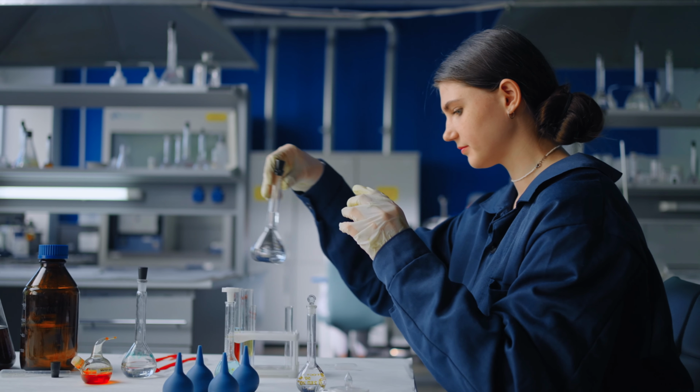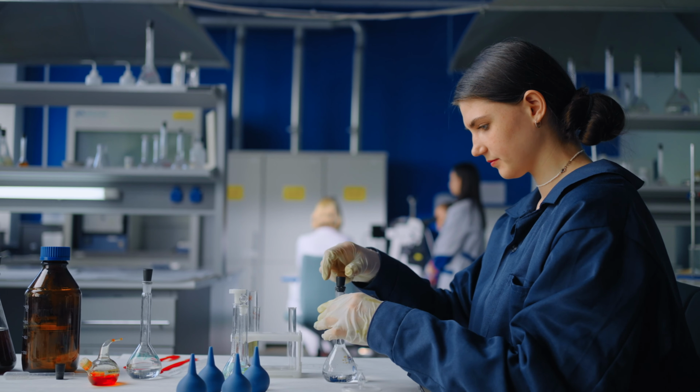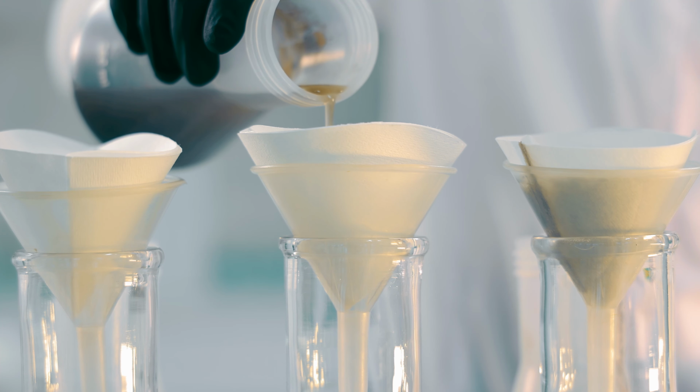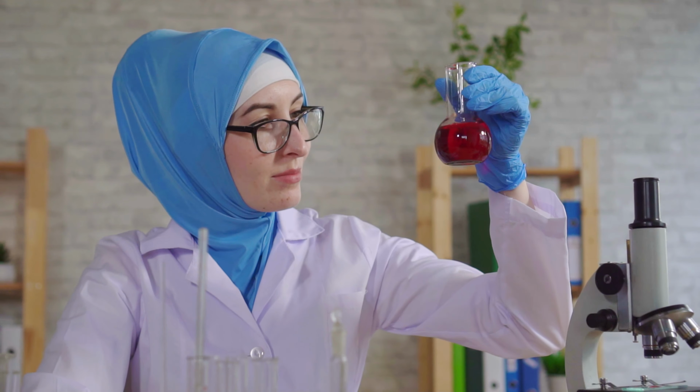Chemists spend a great deal of their time separating and purifying the chemicals that they make. And filtration is one of the basic tools that chemists use to get to their final product. In simple terms, filtration is the process of separating solid particles from the liquid or gas that they are suspended within. It's something we do every day, and in fact it's happening right now in my garden fish pond.